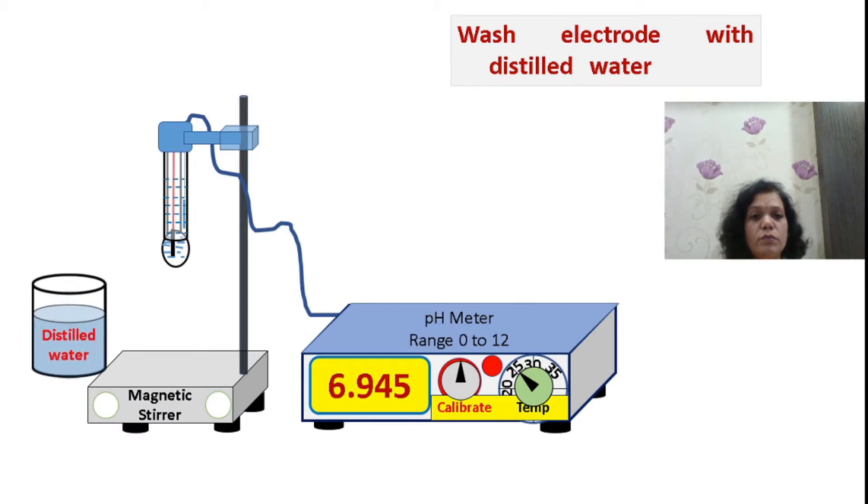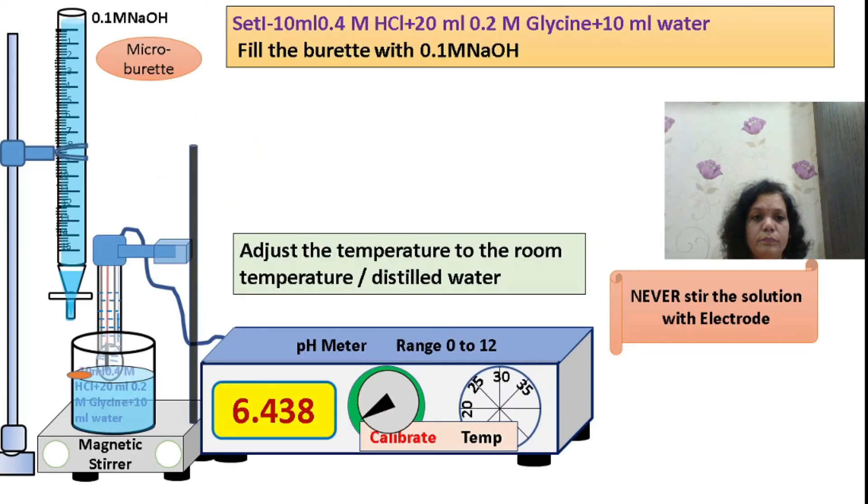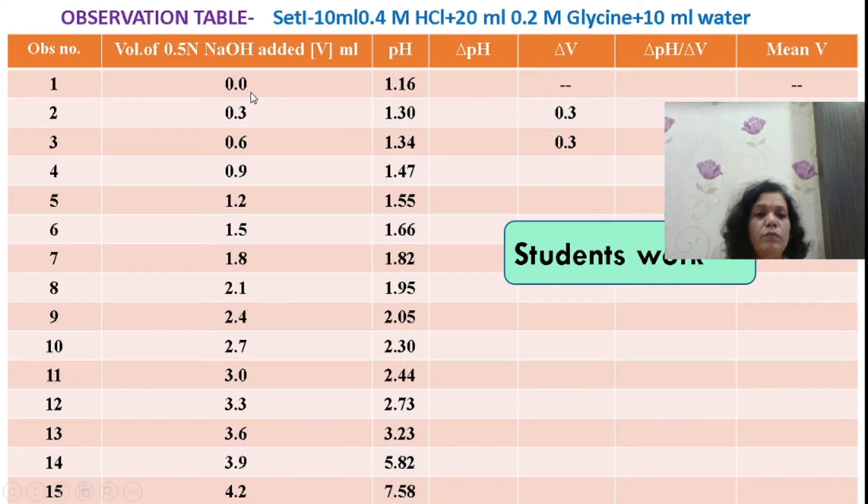This is the experimental setup: a burette filled with 0.1M NaOH, and a beaker containing 0.2M glycine solution (20 ml) plus 10 ml water and 10 ml of 0.4M HCl. This solution with a magnetic stirrer is ready and attached to the pH meter. Measure the pH every time during titration, with every 0.3 ml addition of NaOH. Use the magnetic stirrer and measure pH before and after each 0.3 ml addition of NaOH.